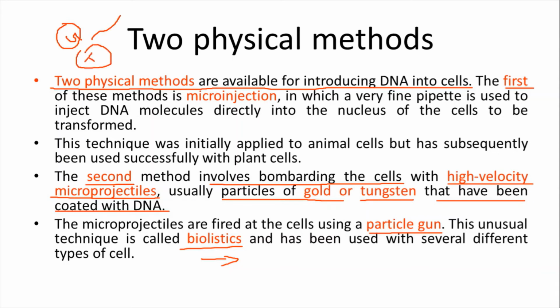The microprojectile is placed here, the piston works, and immediately the DNA is delivered and may get inserted.